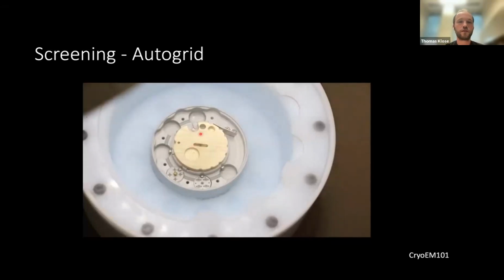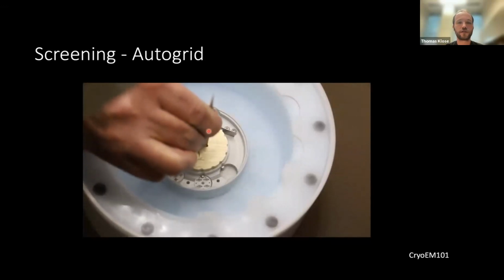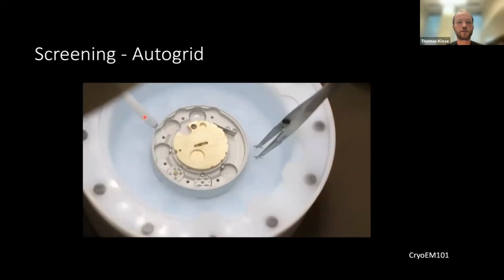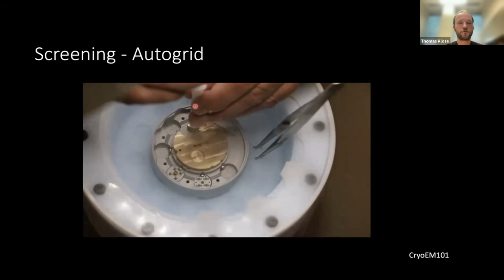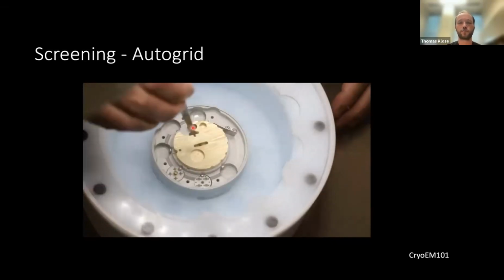Then the top of this workstation gets rotated like this. And so now it is in a position where this clip ring tool can be positioned right on top of the auto grid. So remember, our little clip ring is at the bottom of this barrel. And so now put this on top, you push, and the ring will come out and expand and then hold the grid in place.